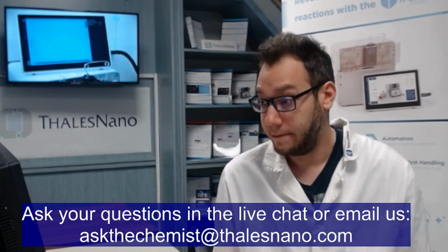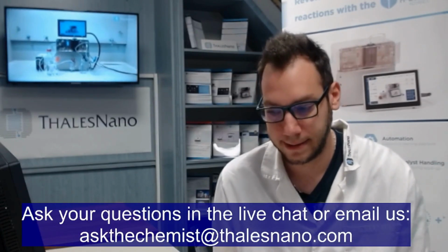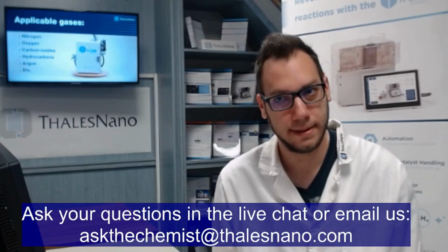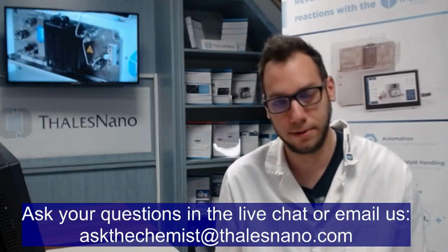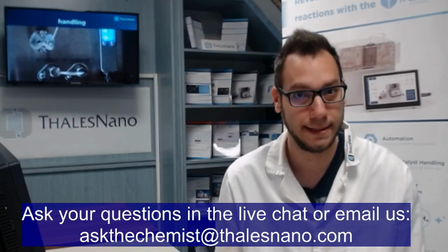All right, we do have a third question, which is, what is the solvent and acid tolerance of the reactor? As for solvents, almost all types are completely usable. The only thing that's not exactly recommended, or you have to handle with a little bit of care, is the halogenated solvents, so dichloromethane, chloroform, because that can damage the plastic parts of the system, for example, the membranes and the sealing gaskets of the catalyst cartridges.